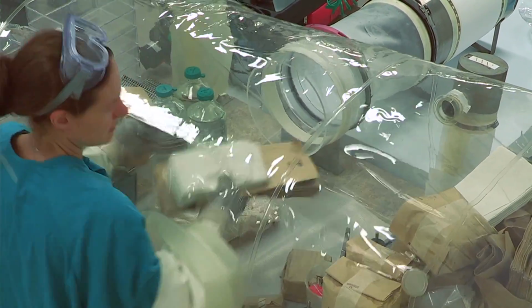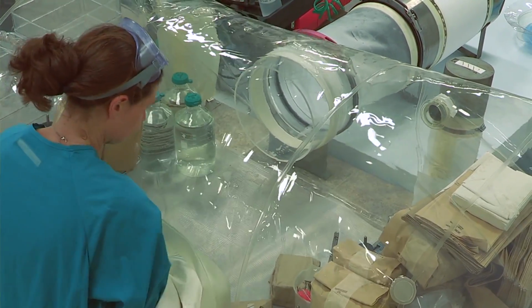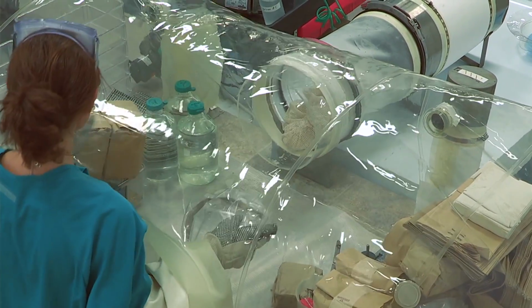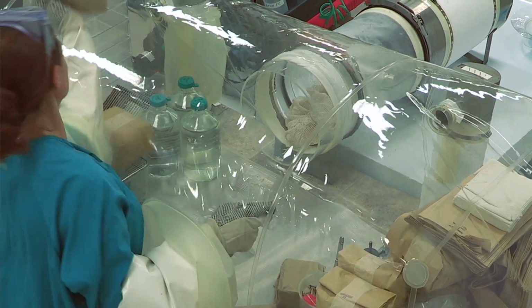Out of the way. Okay. All right, so next I'm going to show you how we take samples for the microbiological monitoring.